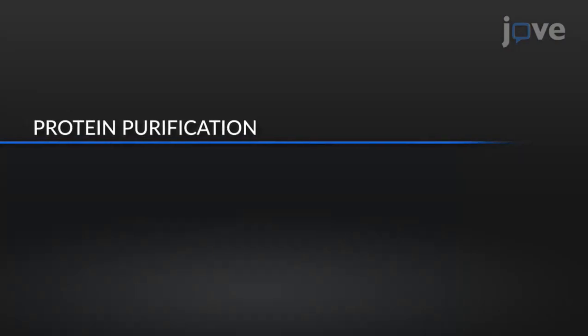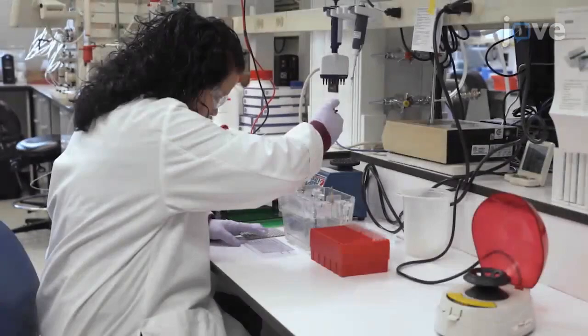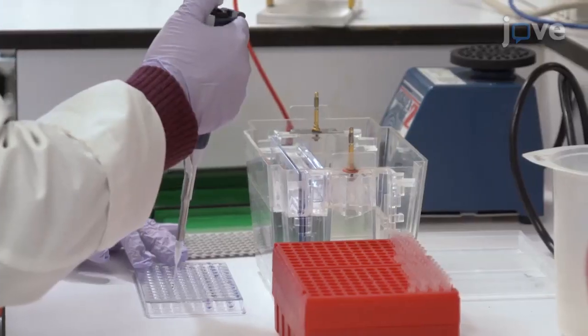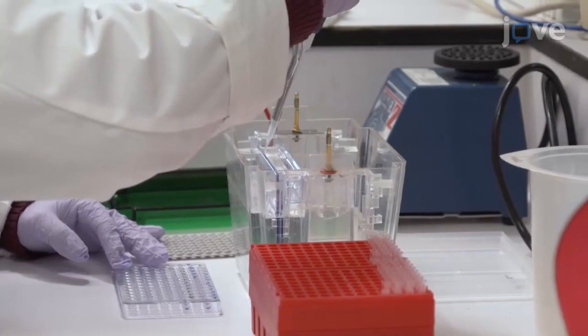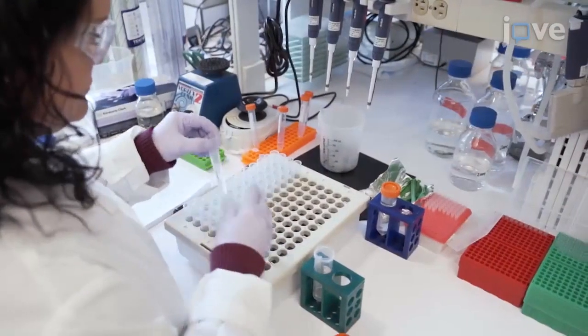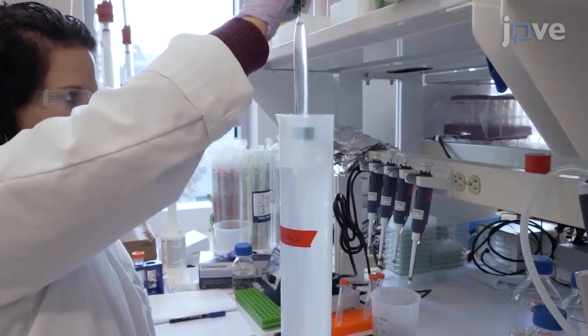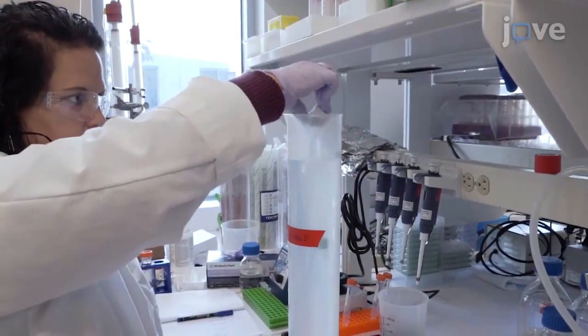After lysing cells, clarifying the lysate and purifying the target protein by IMAC, analyze the protein fractions using SDS-PAGE and Coomassie staining. Pool the peak fractions and dialyze the pool overnight against 2 liters of buffer D at 4 degrees Celsius.